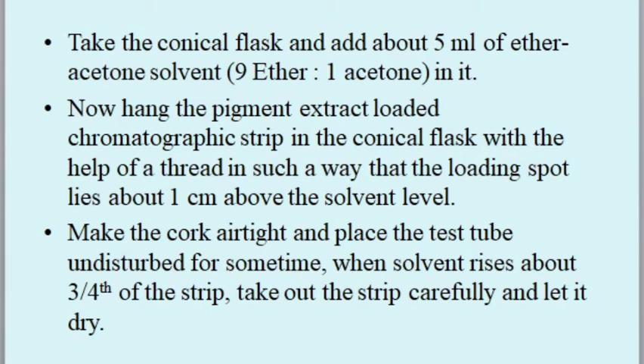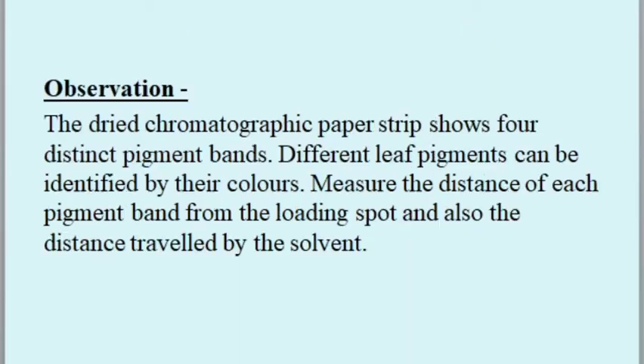Observation: the dried chromatographic paper strip shows four distinct pigment bands. Different leaf pigments can be identified by their colors. Measure the distance of each pigment band from the loading spot, and also the distance traveled by the solvent.